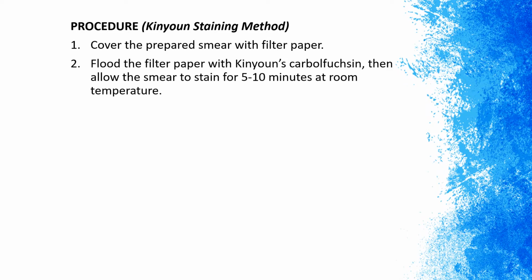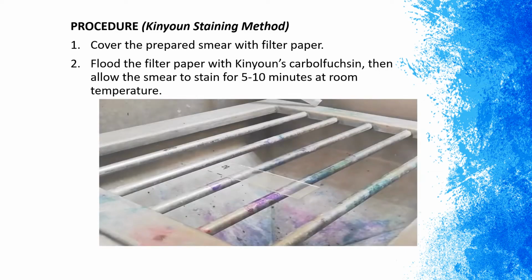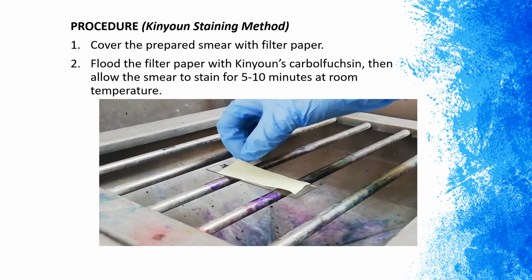So first, cover the smear with filter paper and then flood the filter paper with Kinyoun's carbol fuchsin. Then allow the smear to stain for 5 to 10 minutes at room temperature.